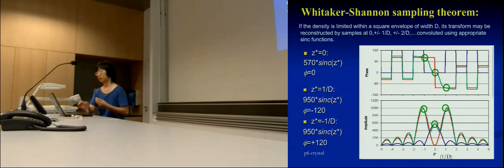Okay, in other words, I don't have to know that much about every function. I just have to say, okay, if I measure the value at z star equal to 0 to be this value, that must be the amplitude of the term for z equal to 0.